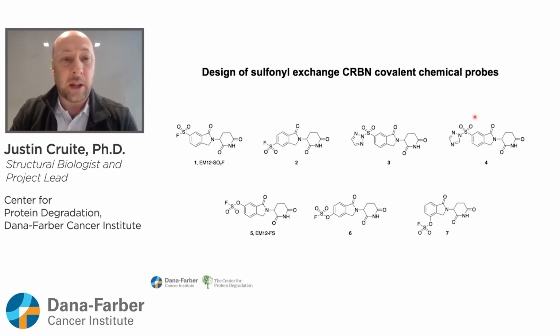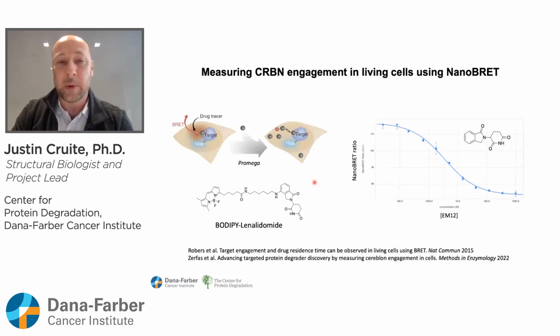So we designed and had synthesized a number of imid derivatives with either sulfonyl fluoride, sulfonyl triazole, or fluorosulfate warheads. And then the first thing that we wanted to do was confirm that those covalent derivatives bind to the imid binding pocket of cereblon in live cells. And so to do that, we developed a cereblon engagement assay based on similar technology developed by Promega.